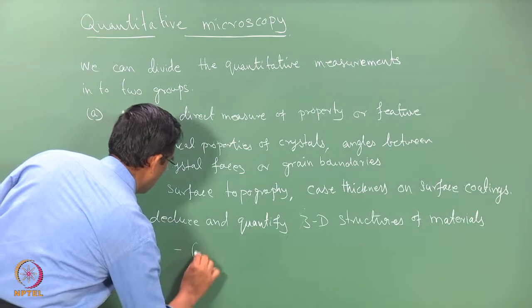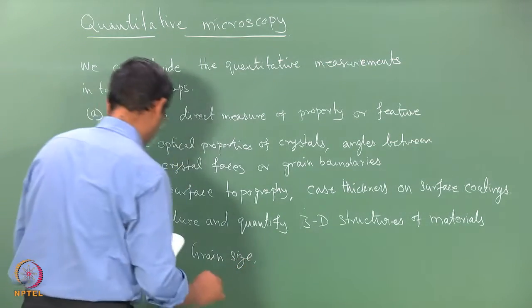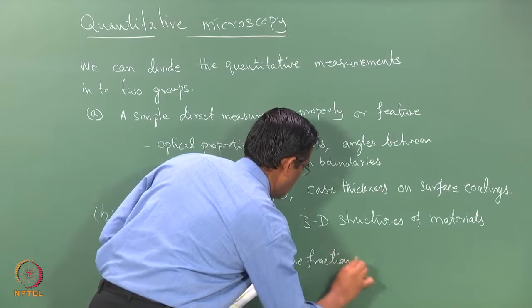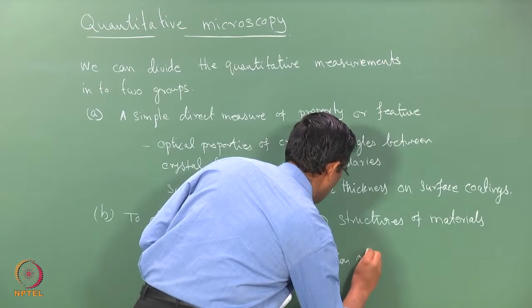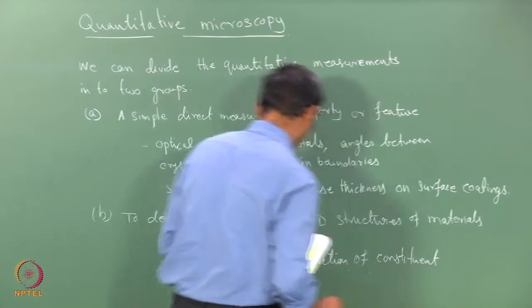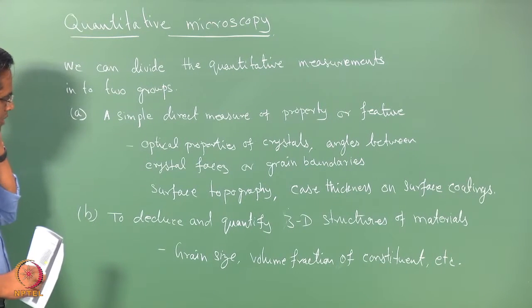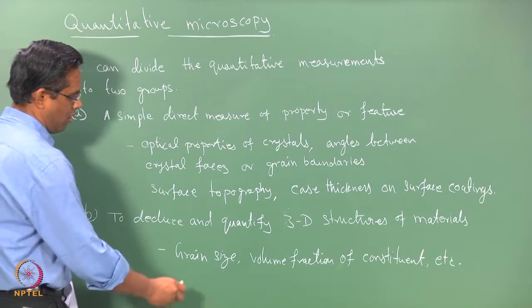For example, what all comes into three-dimensional structures of materials, such as grain size or particle size.